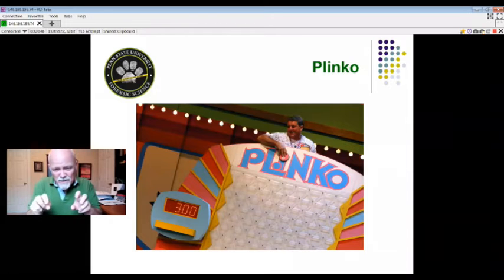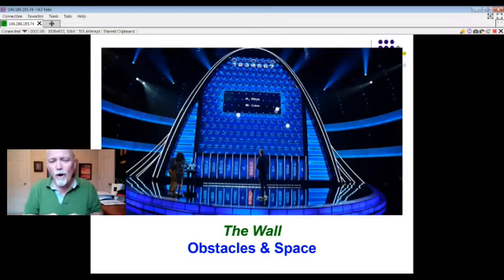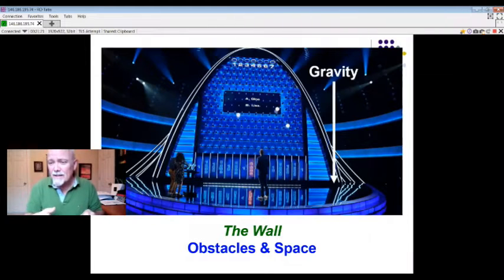Now, I think of it more as a Plinko environment, where you start with your DNA and protein on one end and it starts to move through your obstacles. Maybe you've seen the show The Wall, a game show in the United States where they play this game and answer questions. These balls go down through the Plinko machine and go into slots that give them lots and lots of money or take away lots and lots of money. But the way we get the balls through the Plinko is just by gravity. You release them and it just falls because of gravity. Typically when we're doing electrophoresis, we can't use gravity. We have to apply some sort of force to move those molecules through the obstacles.